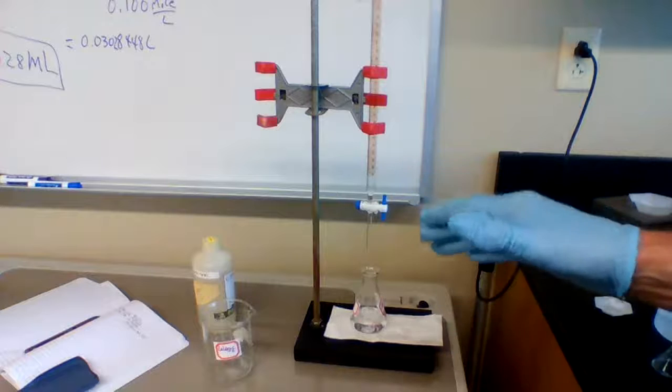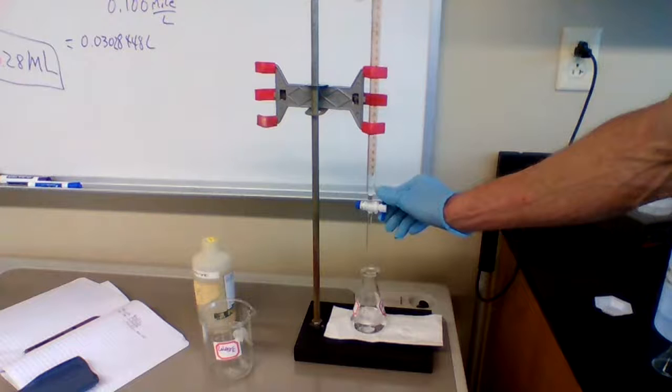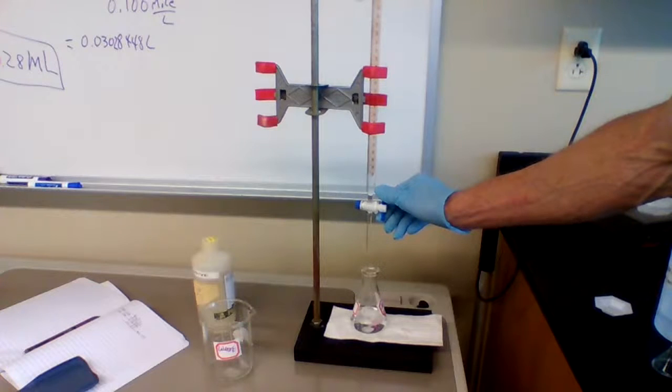We said 30 is about where we should end at. Get our endpoint, which signifies our equivalence point. And we're going to go to 25 quickly. The calculation's nice usually.